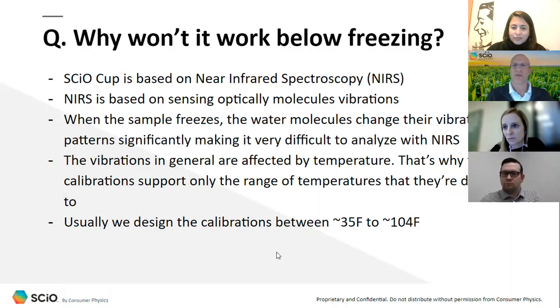It will not go below freezing point because when the material actually freezes, water molecules are completely changed, and near infrared spectroscopy is based on vibrations of molecules. Therefore, when the sample freezes, the vibration mechanism changes completely and it becomes much more difficult, up to impossible, to use that method. That's true for almost every near-infrared spectroscopy-based device. It won't go below freezing point.